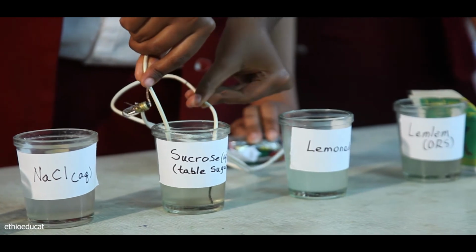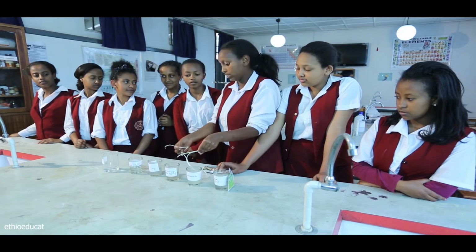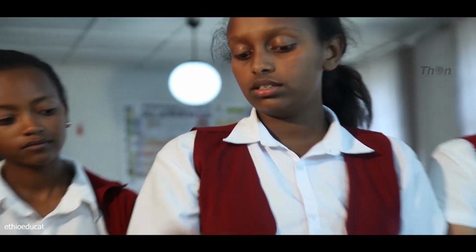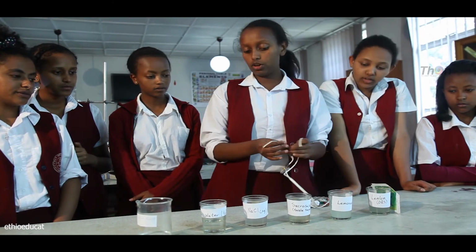No. So what does this prove, Efrafa? What can you understand from this? It's because sucrose is a molecule. It's an organic molecule, so it's made from a covalent bond. So we have proved that up to now we have seen that water is covalently bonded, sodium chloride is ionically bonded, sugar is covalently bonded.